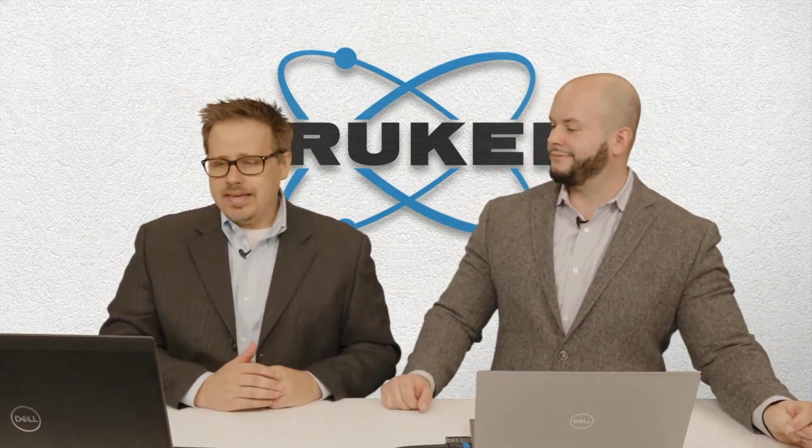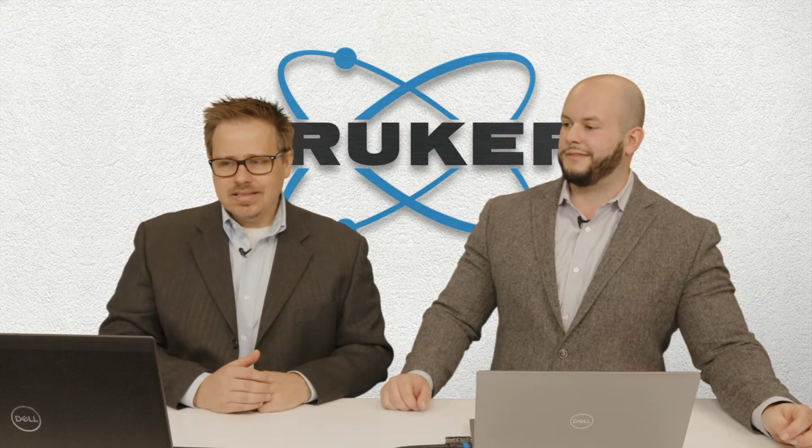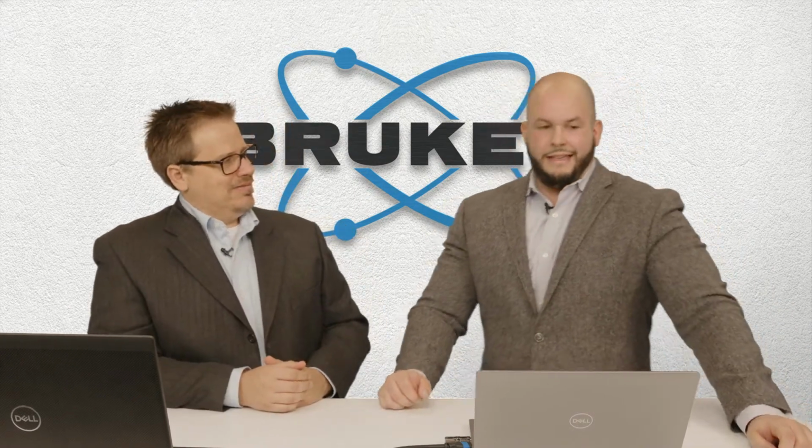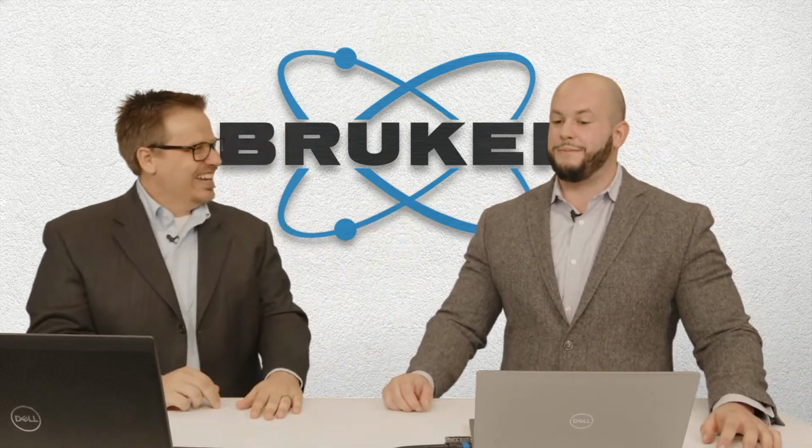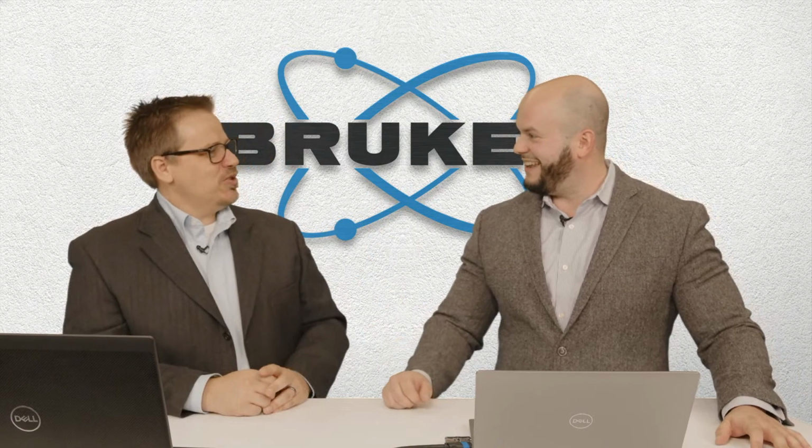So to get over to the questions that are coming live, first of all, from Marty, is there a limit to the size of the object? Well, can I measure an engine block? Right? I mean, it depends on how big your diffractometer is. That would be true.